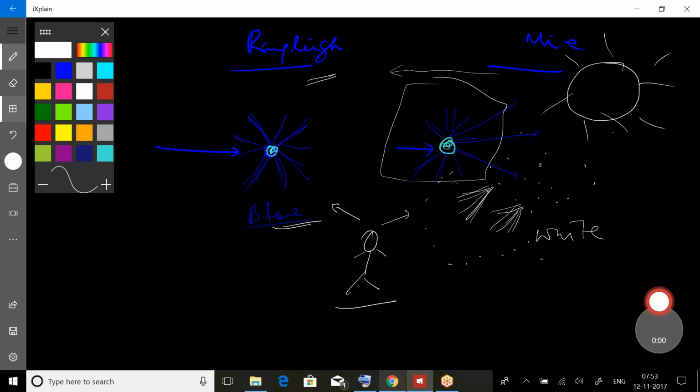For example, 400 nanometer light would exhibit Rayleigh scatter somewhere around 8-9 times higher than a red wavelength. That's why we see the sky is blue, and around the sun it is white. With Mie scatter, large particles scatter more intensely in the forward angle, whereas small particles show Rayleigh scattering, with the large angle scatter more intense compared to Mie scatter.